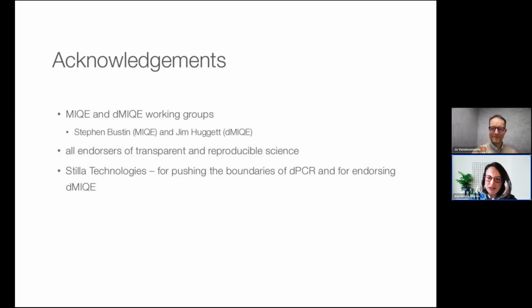I just maybe take one last question. Okay, so this one probably for you also on the multiplexing. Could you explain how the probes for multiplexing are designed? Would that be target specific or universal?